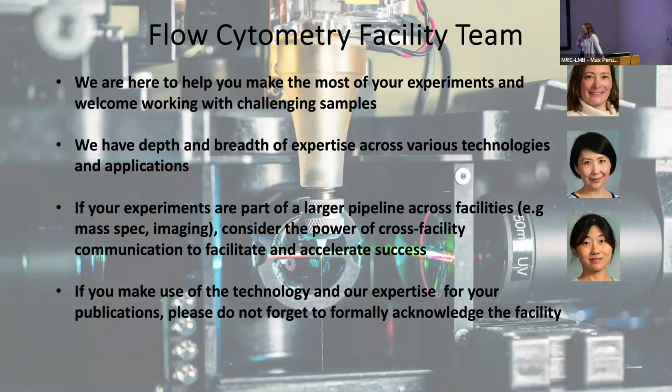We all have a depth and breadth of expertise across various technologies and applications. We all have our strengths, so please come and talk to us. And if your experiments are part of a larger pipeline across facilities, for example, you're purifying something for downstream mass spec or any kind of imaging, particularly cryo-EM, really think about the power of cross-facility communication to facilitate and accelerate the success of any kind of downstream experiments.